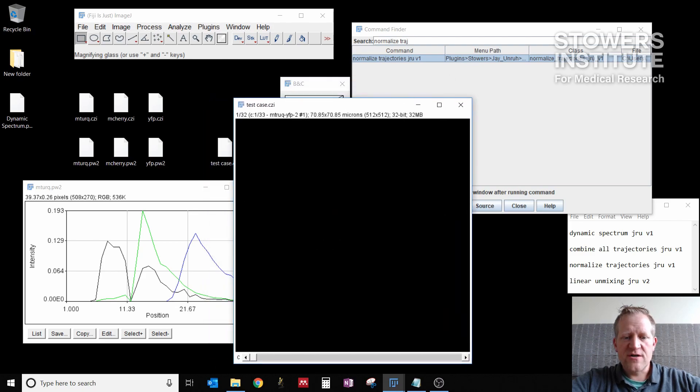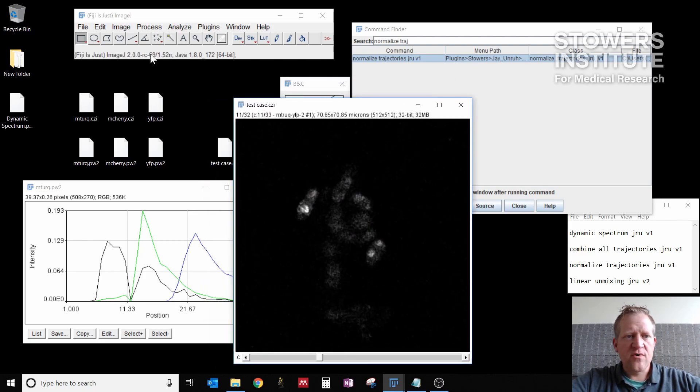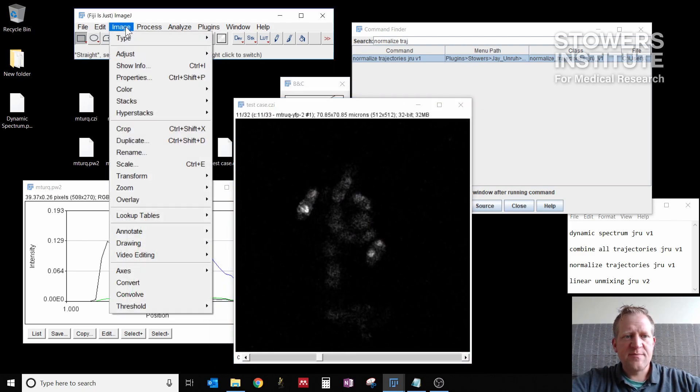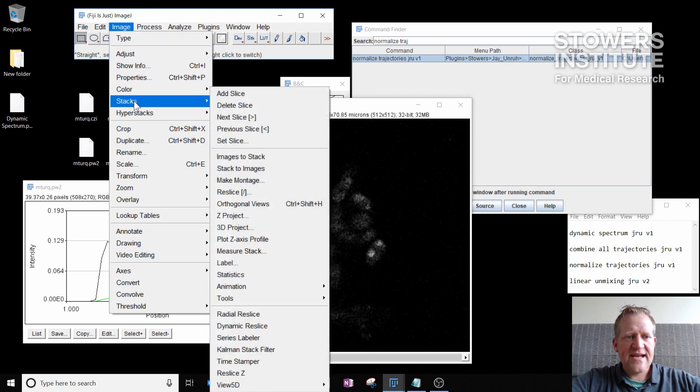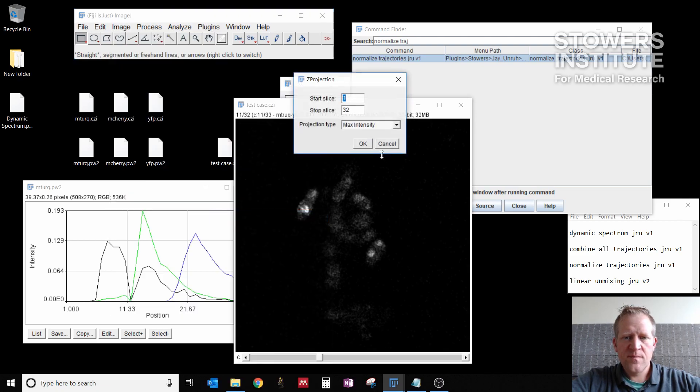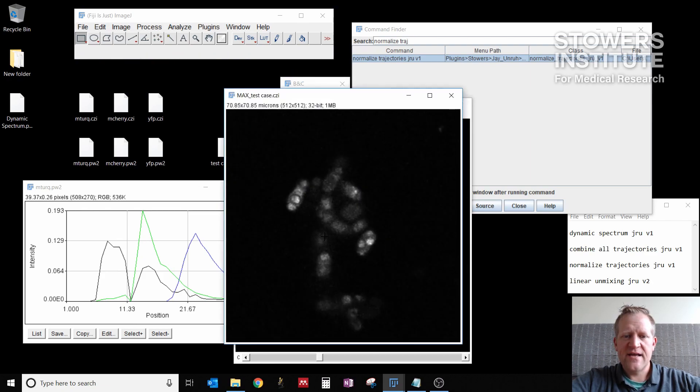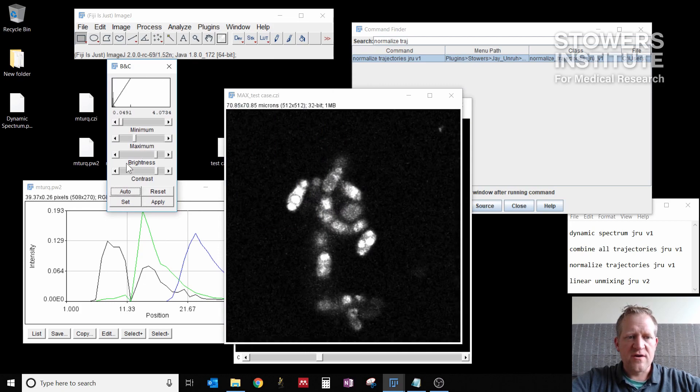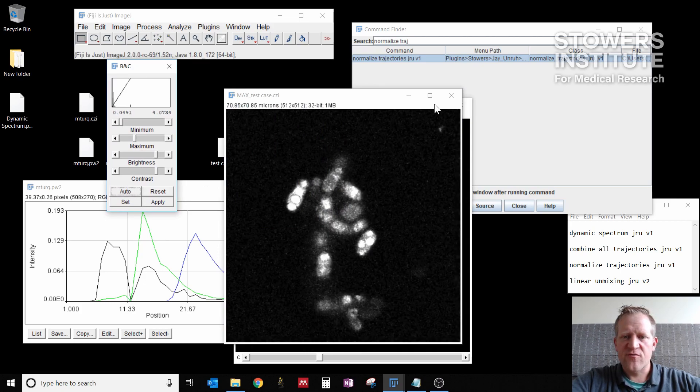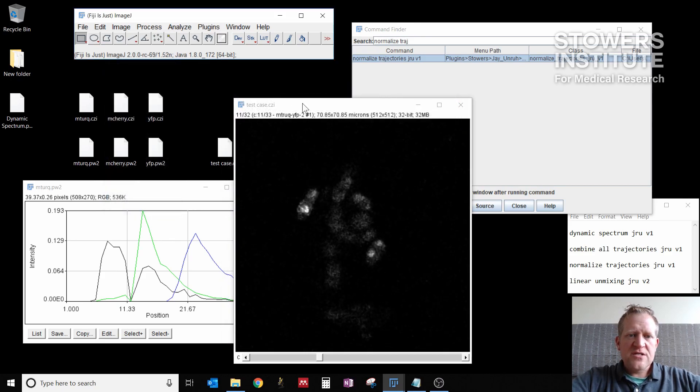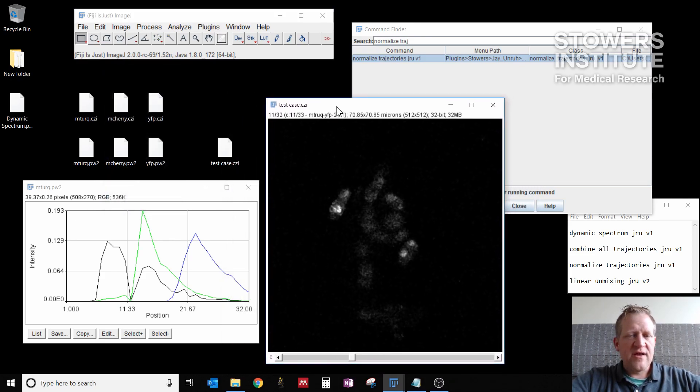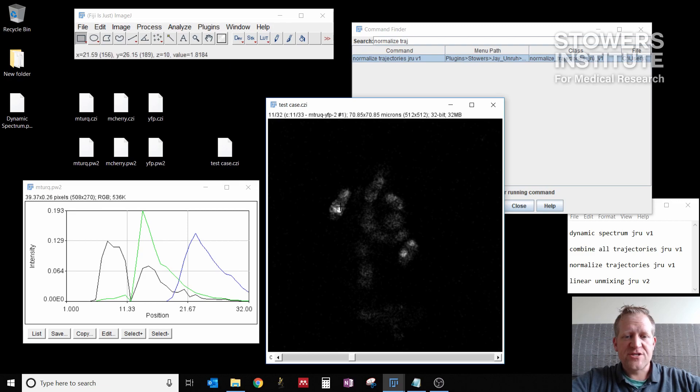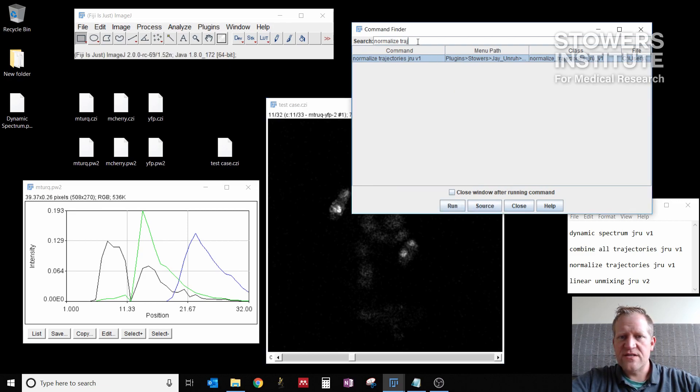It's also hard to see what's going on here, so I'm going to run a Z projection as well. I go to image stacks Z project and again, the max intensity and I click OK. So now you can get a little bit better idea of what's going on in this image. We have some cells here that express a combination of the fluorophores in different spores. In my original window, remember that unmixing won't work on a max projection. In my original window, I want to do linear unmixing JRUV2.